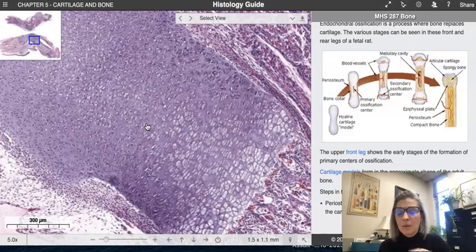So you have lots of fibrous connective tissue. You have to make membranes. You have to make this joint. You have to make all that connective tissue, and all of your spongy bone, and all the compact bone, and blood vessels, and all that good stuff is going to basically be happening here. And so you have lots of differentiation of these cells, but you have to remember, this is an embryonic slide, so we're heavy in development.